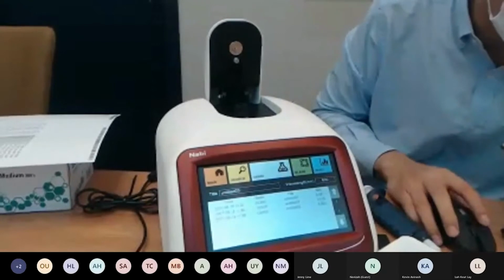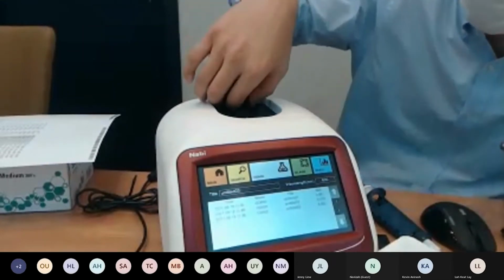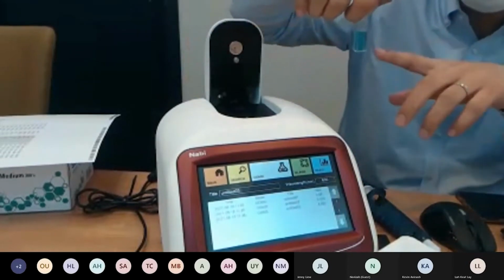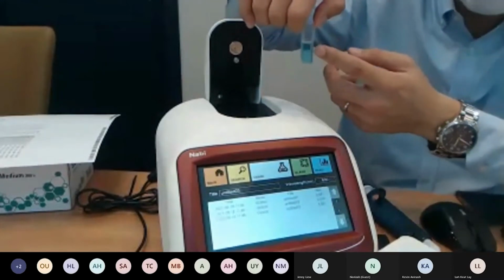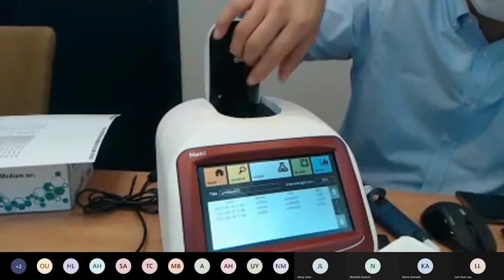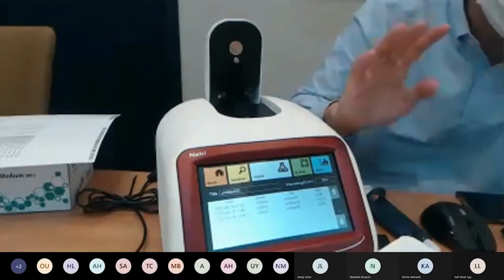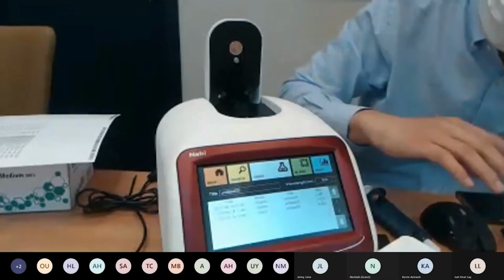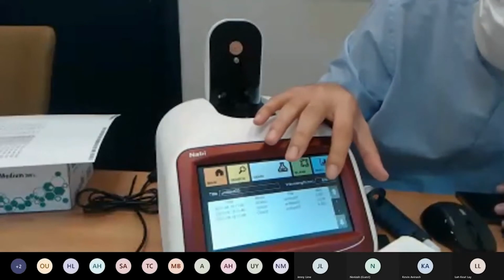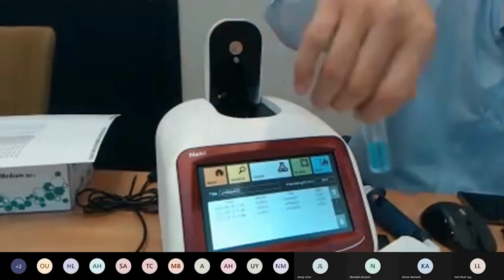So we usually, due to these cuvettes being very sensitive, if you measure too many times at once, then there might be black spots that appear on the cuvette, and that might skew the results. So we recommend at least waiting about 3 to 5 seconds before measuring again. So you can see 0.581, 0.578, 0.582, so pretty standard.